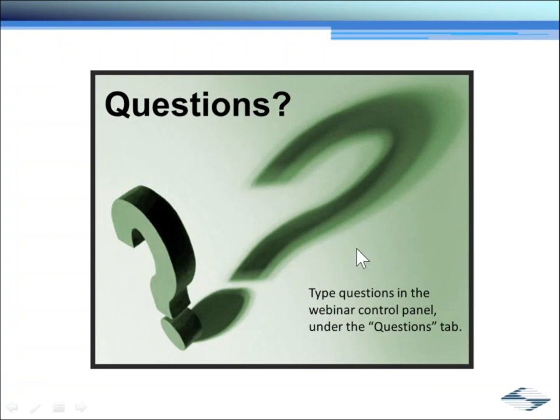So this person would like to know, getting back to the question of switching between full scan of an image and bleaching a point of light, 2 issues. Which software has this capability, and how quickly can a laser change wavelength? Okay, so in the FRAP experiment, we wouldn't change the wavelength of the laser, we would only change the power of the laser in order to bleach the molecules.